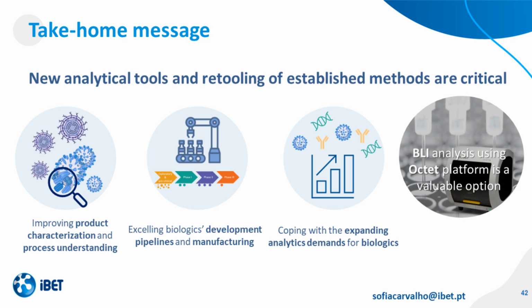As we already discussed, free protein does not present a measurable wavelength shift. So in fact, we are measuring only the virus or the virus-like particle.